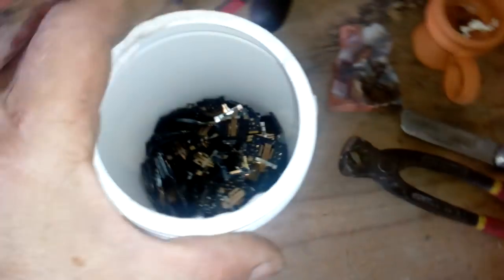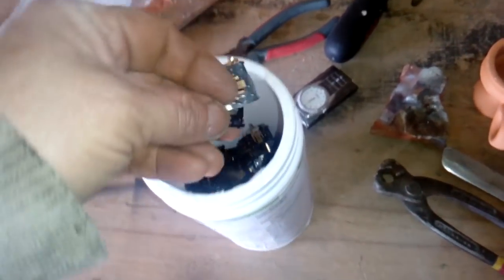Hey guys, today we got something special. See that? This is a contact — it's a gold contact from the fingerboard, from the old Radgen device. You got gold contact here, and on the other side this is the copper with the gold plated here and here.